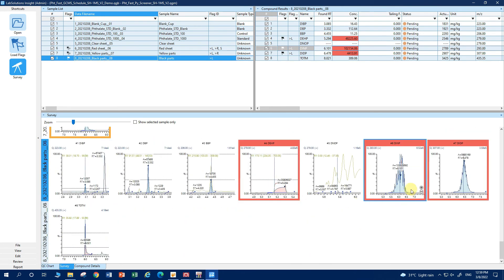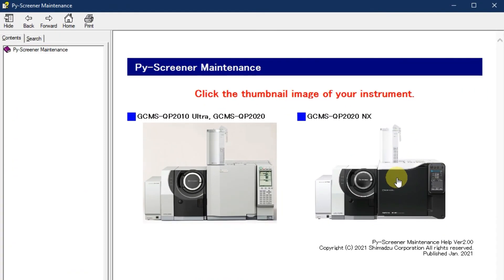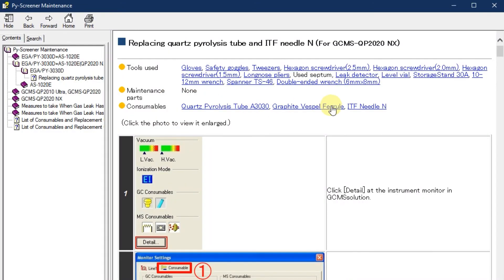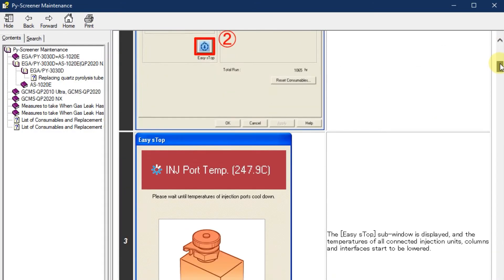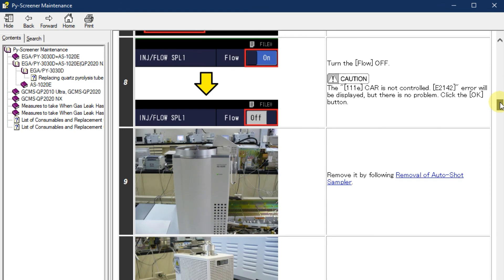Lastly, PY Screener provides a detailed maintenance guide for users to perform maintenance when their system is dirty. Users only need to click on the correct instrument model, followed by the part of the system to be maintained, and the page will show the steps to follow with pictures included. With the maintenance guide provided, it will help reduce instrument downtime, as users will not need to call and arrange a time for the service team to visit for system maintenance.